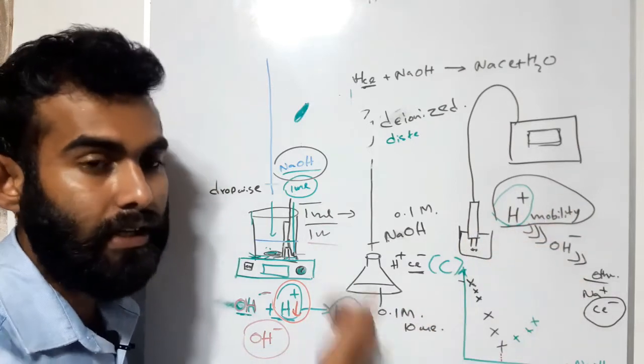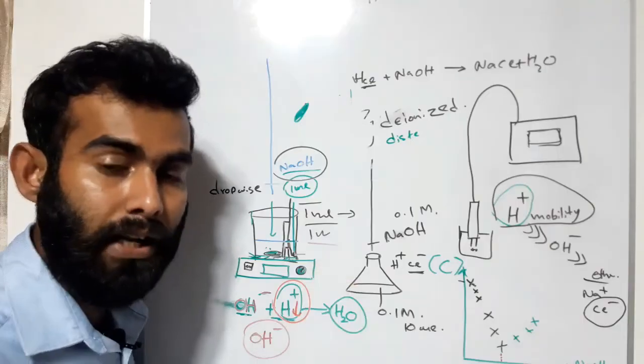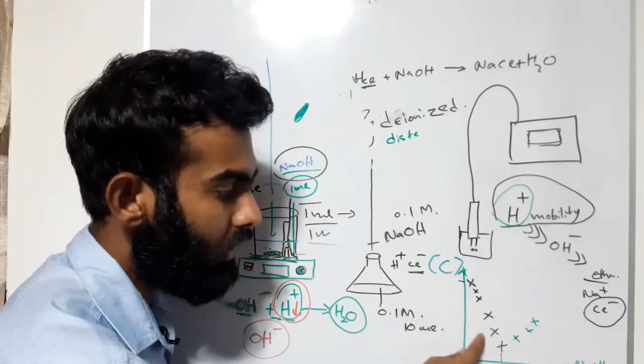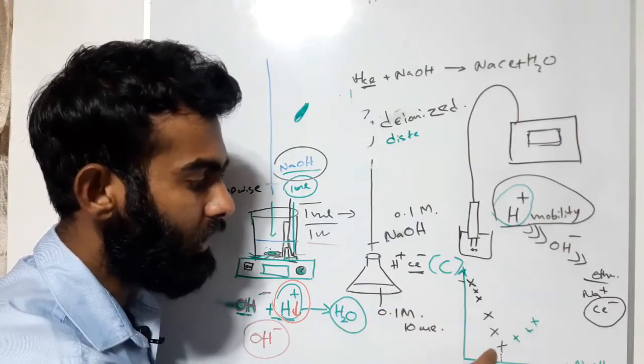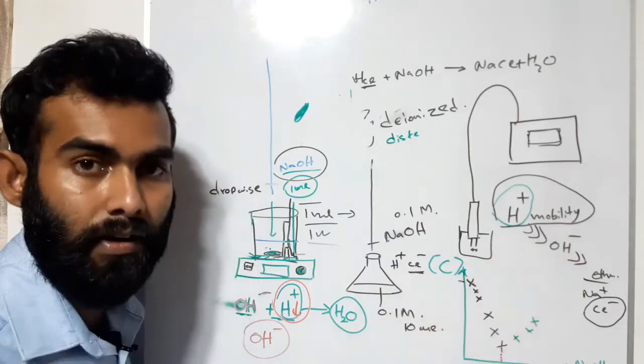H plus අඩු වෙනවා කියන්නේ conductance කරන්න තියෙන අයන ප්‍රමාණය අඩු වෙනවා. ඒ හින්දා මේක එන්න පල්ලෙහාට යනකොට අඩු වුණා. මේ conductance value එක. හැබැයි එක point එකකදී මොකද වෙන්නේ? එකපාරම වැඩි වෙන්න පටන් ගන්නවා conductance.